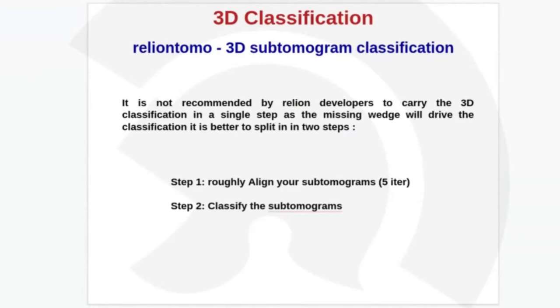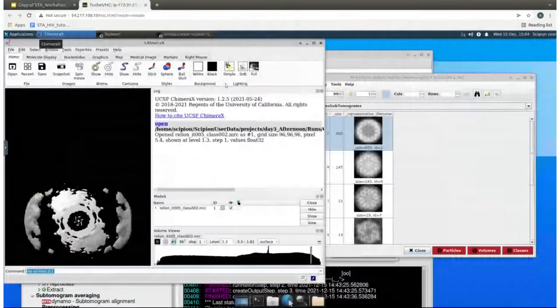We select them and we give the subtomograms that had already this alignment to a second step, which is the classification. In this step, we give those subtomograms to Relion, so it will classify them in 10 different classes, but it won't align them. After this second step, this is the one that I'm analyzing now, the classify subtomograms step. And to observe this, I will restart.